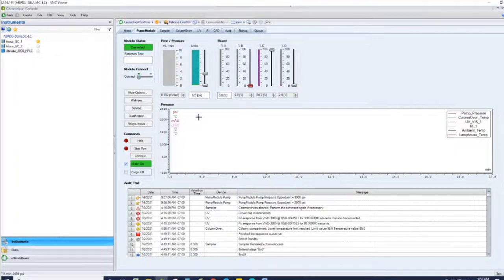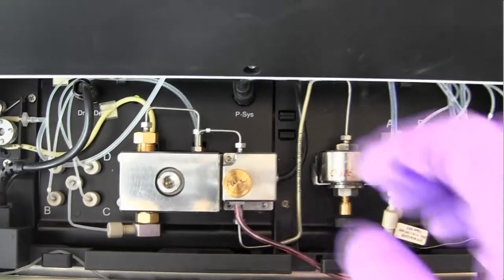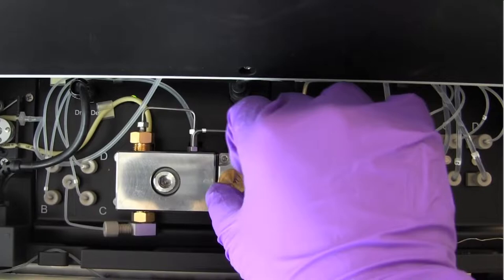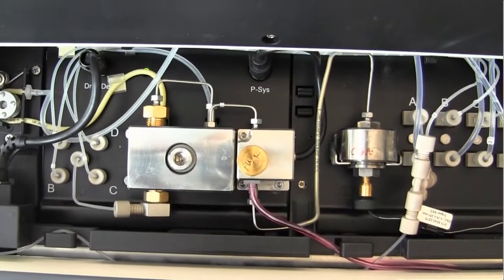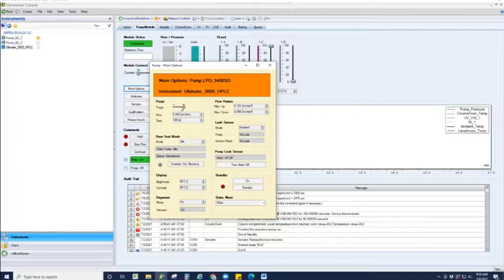In standby mode, the pump should be set to 0.05 or 0.1 milliliters per minute in order to maintain constant flow through the column while saving the eluent. As previously stated, one should purge the pump when replacing eluents. In the Pump tab, select More Options. Open the door to the pump compartment and turn the valve labeled Purge to divert the eluent flow away from the column. Once the purge valve is open, select Purge within the More Options operating box. Once the purge is complete, remember to close the purge valve.